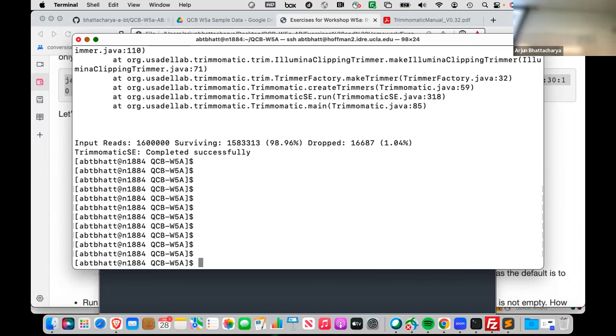So figure out where you want it. Okay, so is your jar file invisible? So where is your Trimmomatic file? It's right here, right? So you can just write out the full path to it: /u/home/m/your username/this/that/ all the way through. It's a really big sequence for the path, but it's going to get you there.